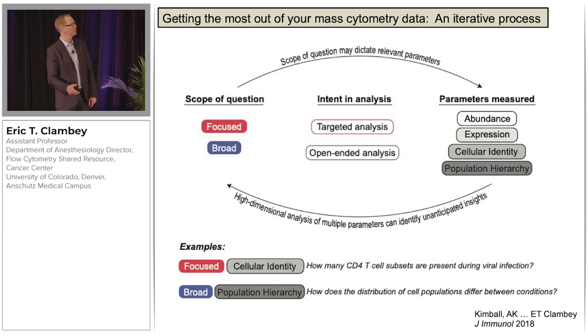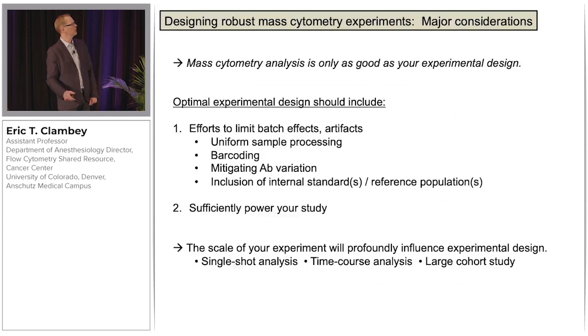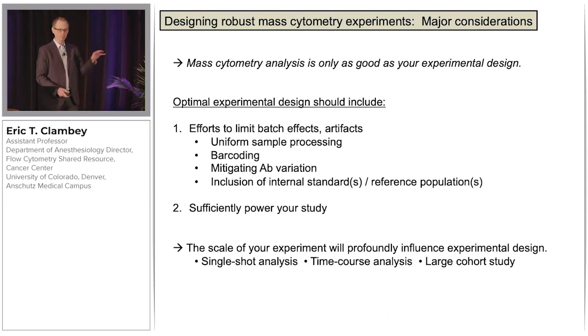Okay. It's also essential to emphasize that your CyTOF analysis is only as good as your experimental design. And this was a discussion by many investigators yesterday. Without good experimental design and good sample quality, it's garbage in, garbage out.